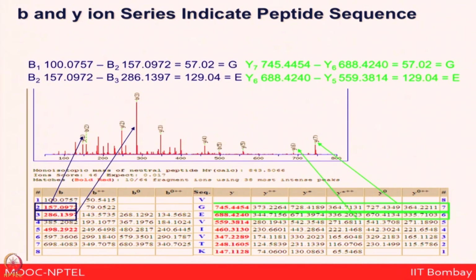So, in this manner you can manually derive the amino acids and make the peptide sequence for a given stretch of sequence. This is just some basic understanding for you of how the peptide sequences are being derived. Of course, you can do it manually, but if you have to do it for thousands or millions of peptides, then you need to use these software tools to obtain this information in a much more high-throughput way.